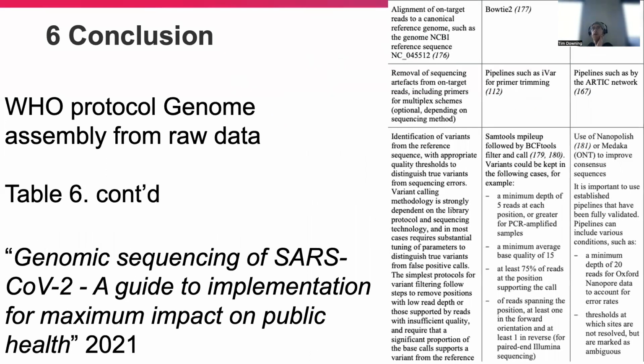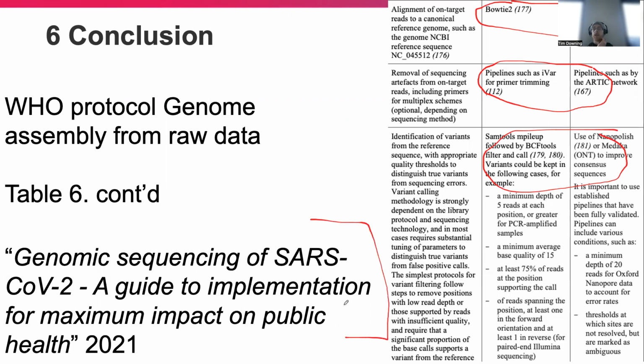That was in the previous practical. And then in G03, we'll look at things like mapping tools. And we'll also in G02 look at, well, that's built into the previous steps, but we'll look at G04 on calling mutations as well. So that's how our approach is linked into standard protocols for looking at public health outbreaks.